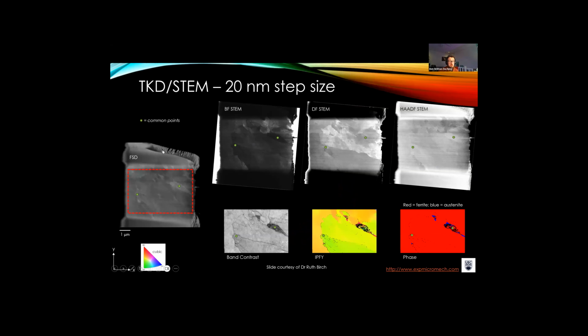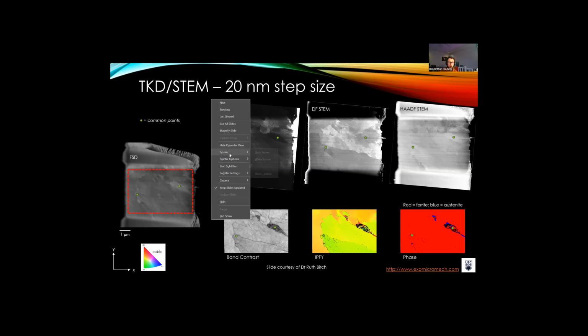We can also use the instrument to do transmission Kikuchi diffraction, and specifically we can do the lift out to make the TEM foil with a uniform thickness all in the same instrument, and then switch it over and put it in for TKD. This is using a symmetry detector, and as I say, we have a STEM detector on the instrument as well. With the STEM detector, we have a diode that presents itself below the beam. We have a thin transparent foil in the SEM at relatively low voltages for TEM type work, and then we're measuring the signal as we move the beam across the surface.